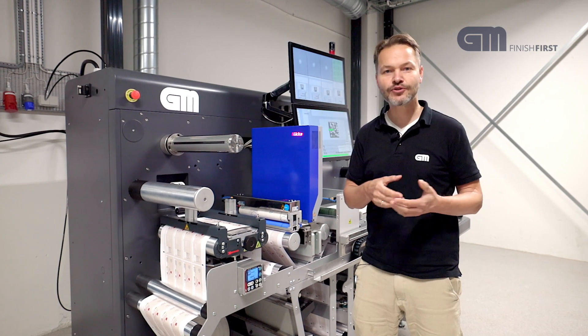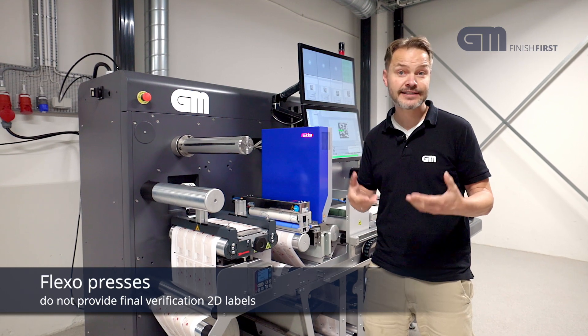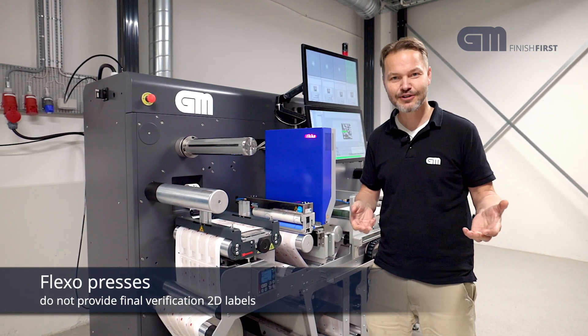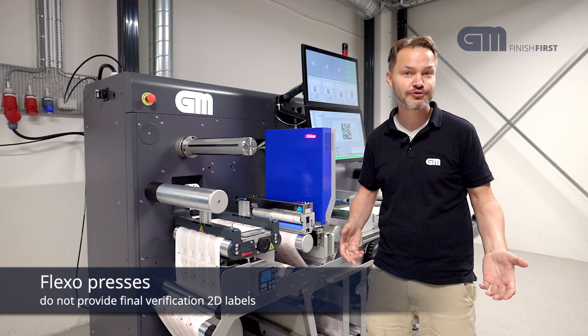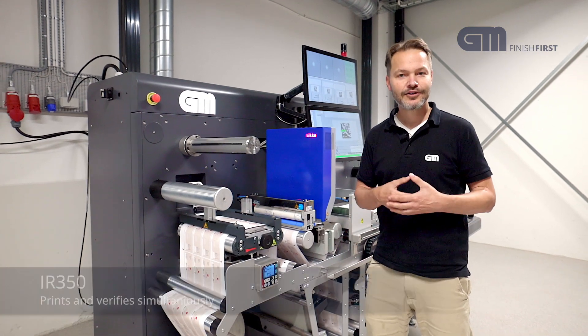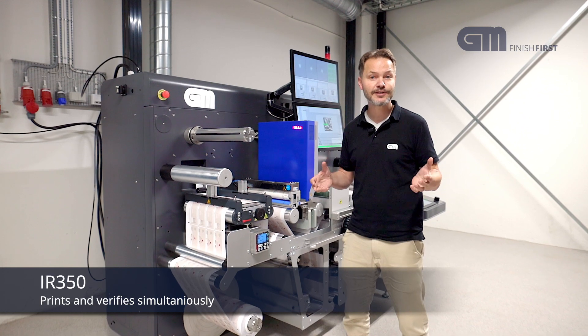If you just print your QR codes on your digital press or on your flexible press, it's actually difficult to verify them in production because you just don't stop a huge press. If you take that process offline to a small machine, you can print and verify at the same time. This is a unique benefit.